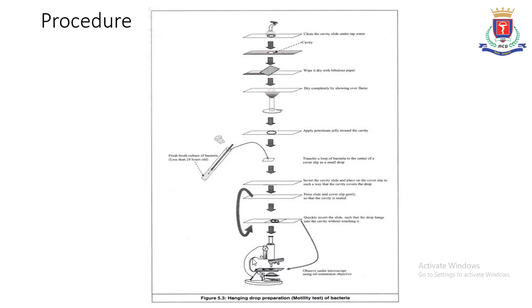just above the hanging drop, and the edge of the hanging drop is observed under oil immersion objective of the microscope. Now we will see the observation. Here you can see the bacteria moving from one place to another in this video.